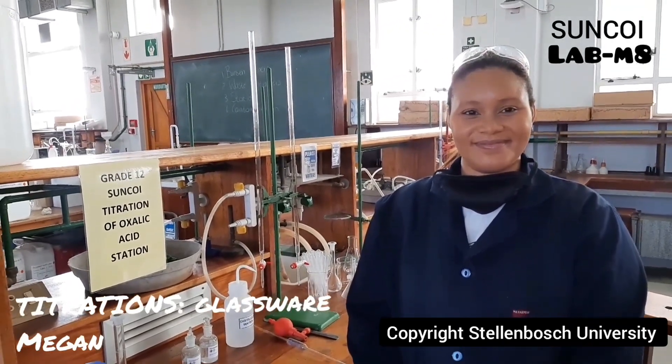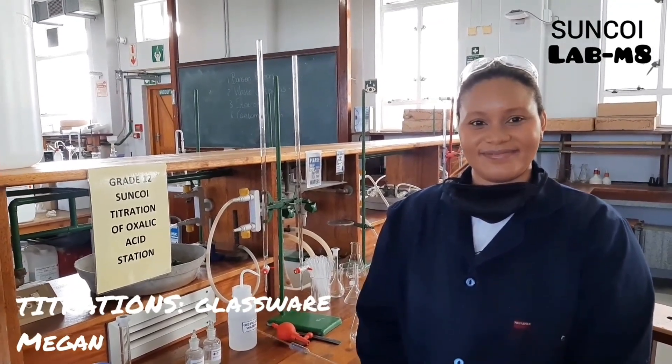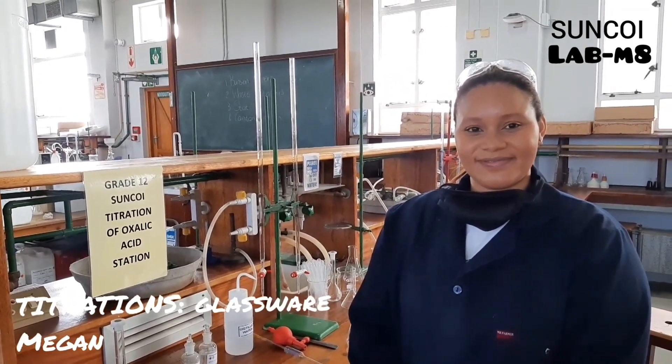Hi guys, welcome to another installment of Labmates. Your Labmate today is Megan. Hi. And Megan is going to show you what glassware you will need to do a titration experiment.